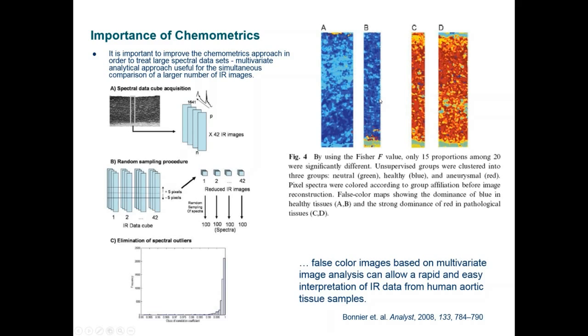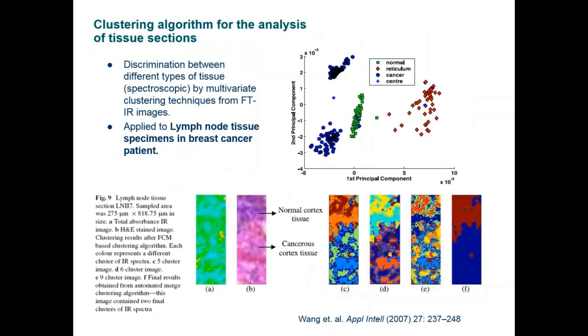So to make a long story short, IR imaging is very useful for further analysis in histology, in that with a normal optical microscope, you only have a static experiment on the cell or tissue. However, with chemometrics and IR imaging, you're able to do time or frequency dependent measurements. And therefore, one can develop different types of algorithm with this data that can be gathered over time.